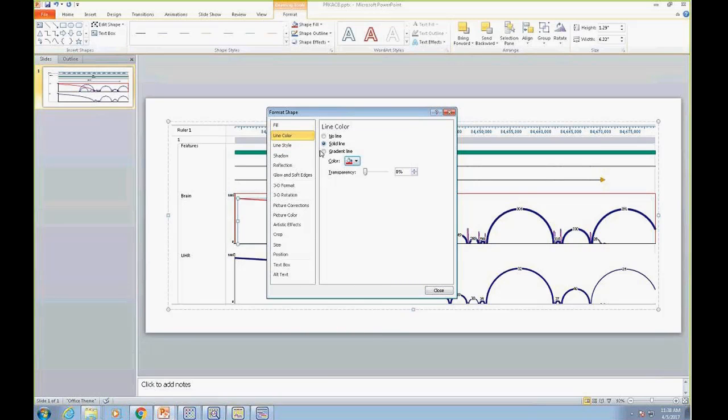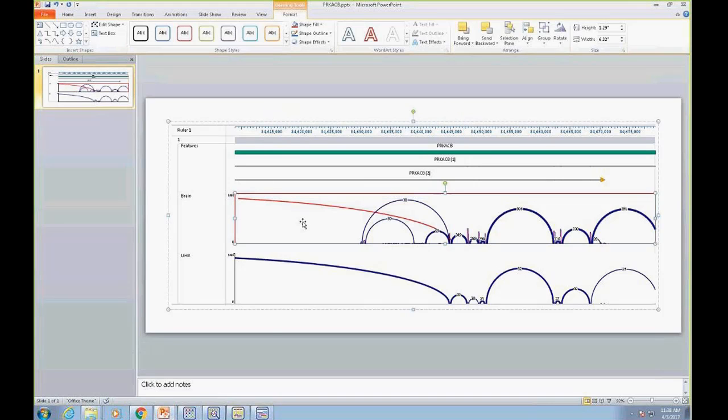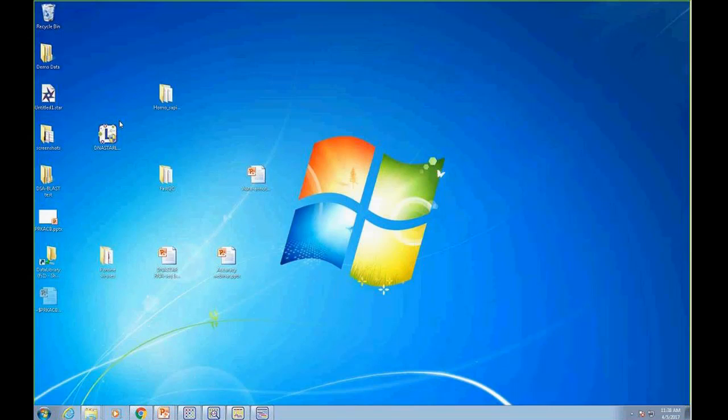And so there, I just highlighted that arc just by changing the color. And I can move it around and edit the text. They're all objects, so if I want to tweak it to get it how I want it for, say, a publication, I can do that in something as simple as PowerPoint or even PDF. So that's one approach to finding some isoforms.